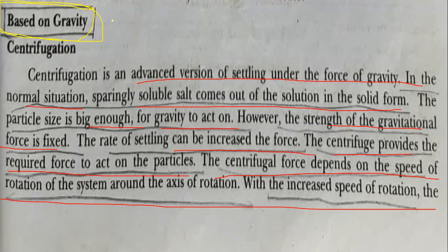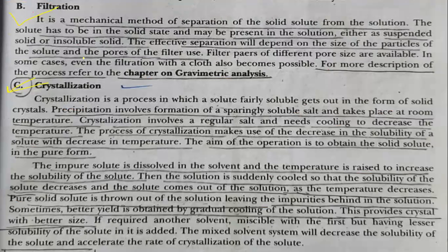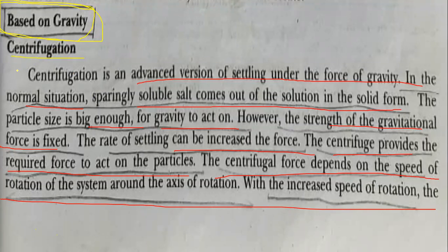Now in this lecture we are going to focus on separation based on gravity. Okay, first is centrifugation. It is an advanced version of settling under the force of gravity.